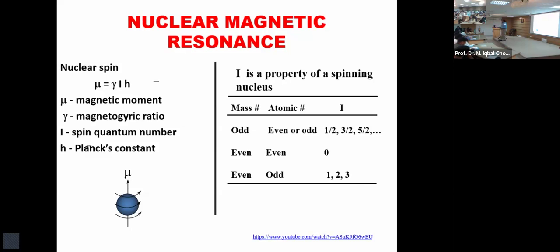So hydrogen has 3 isotopes, carbon has 3 isotopes. Some of the elements, such as tin, have 50 isotopes. All the 3 types of hydrogen are active. So why do we use deuterated solvent for organic compounds in NMR? You use deuterium because deuterium actually has a different frequency.